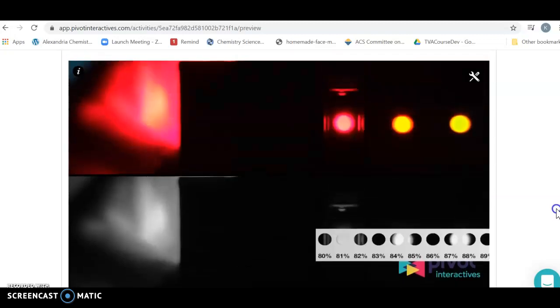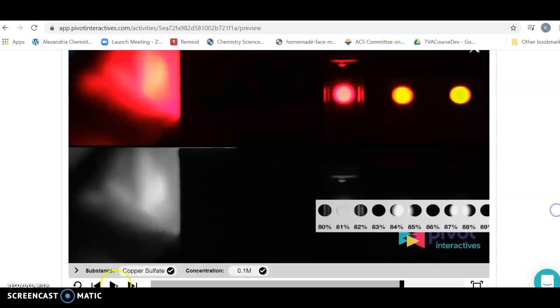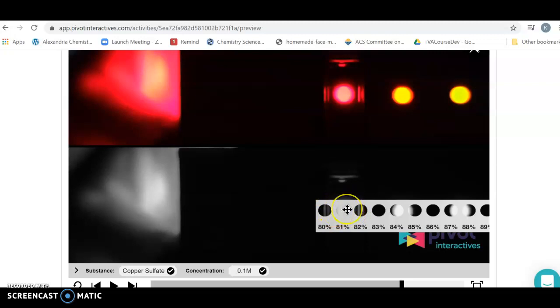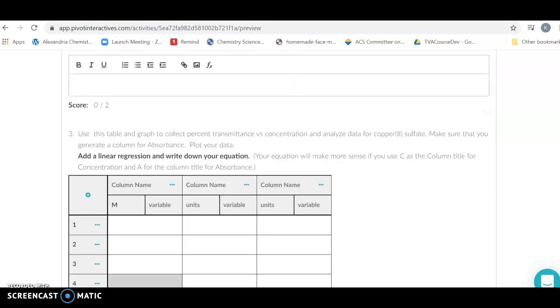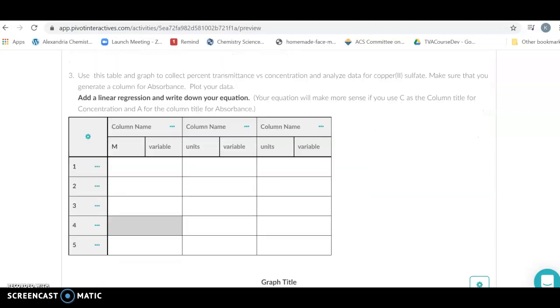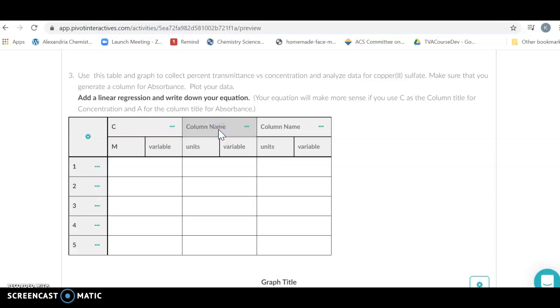I happen to be using the first Beer-Lambert law one, and I'm looking at copper sulfate, measuring the percent transmission as a function of concentration and graphing that. With that in mind, we're going to collect our data.